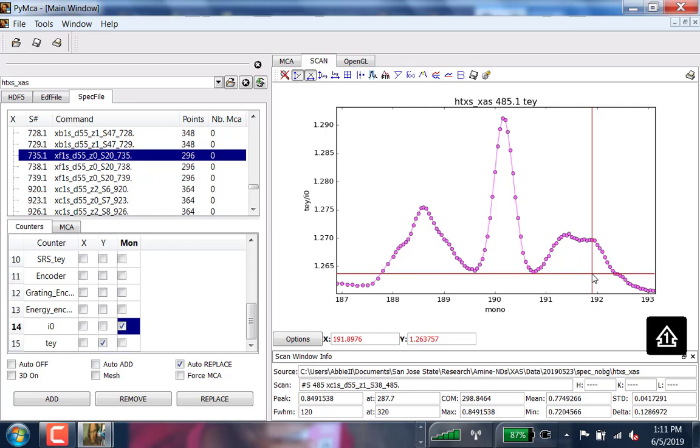We'd probably have to fit these and understand what the features are. But we see a peak right here, here, here. And if you zoom in right here, you didn't see it previously, but this has a shoulder as well. There's another peak, and then the other shoulder. So there's basically a total of 6 individual peaks that we would need to identify and properly assign.